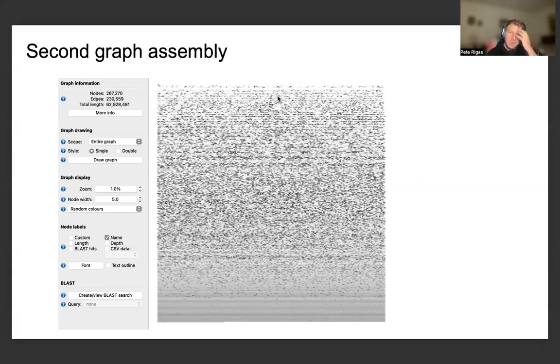And recall that this graph assembly differed from the previous one in that it consisted of approximately 63 million base pairs, in comparison to the first one, which had approximately 7.8 million base pairs. So this graph assembly is undoubtedly much more complicated, with almost 9 or 10 times as many base pairs as the previous sequences contained in the first FASTA output, which can probably give us a richer interpretation of the graph structure and what it reflects in terms of the sequences that we're looking at.